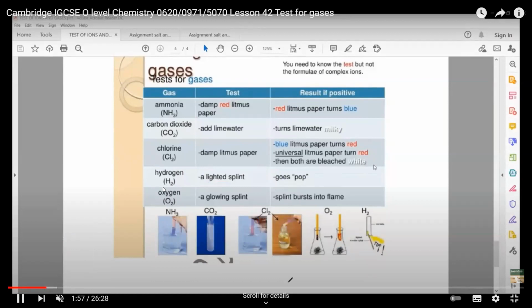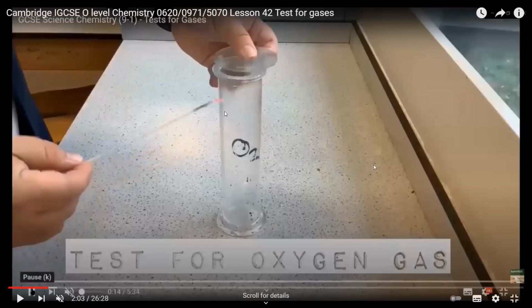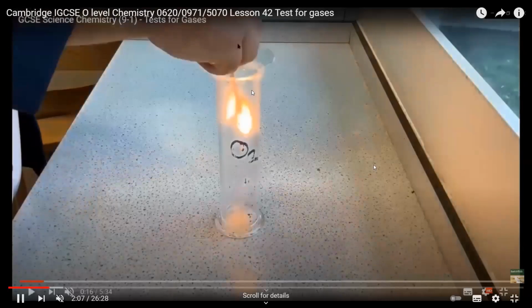For example, the first one: if you want to identify oxygen gas, here you can see this is a glowing splint. You don't see a flame on the glowing splint. To test the oxygen gas, we place it in a gas jar which is completely filled with oxygen.